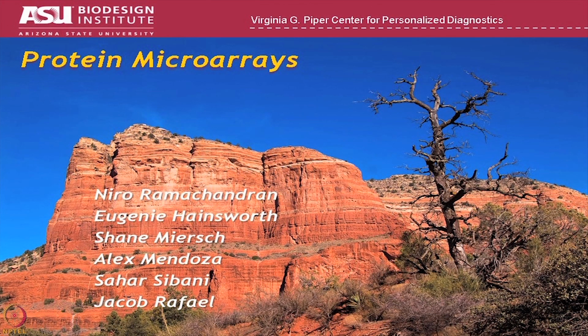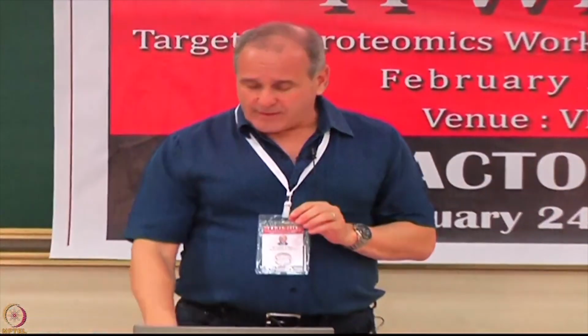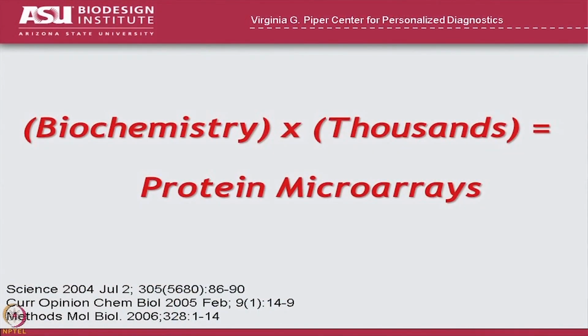So we talked earlier about how having a library of expression clones would allow you to do all kinds of different studies. Well, here's one that we got very interested in, which is biochemistry. If you want to study the biochemistry of a protein, you need to be able to make that protein and do experiments. And if you want to be able to do it times thousands, then that's what led us to the idea of protein microarrays.